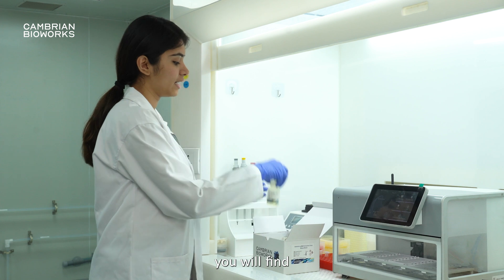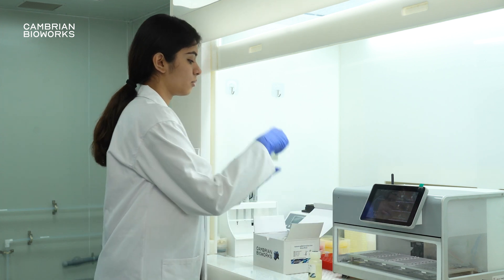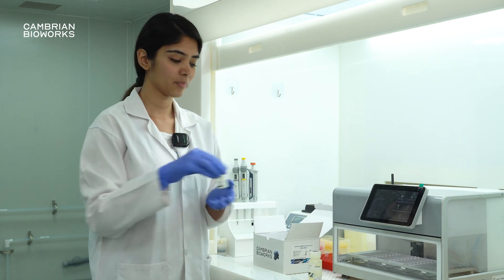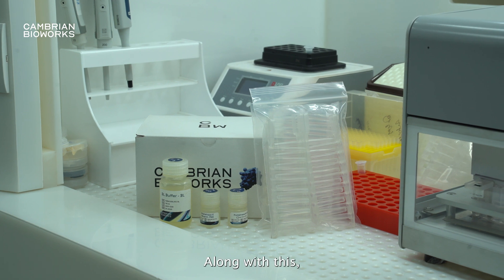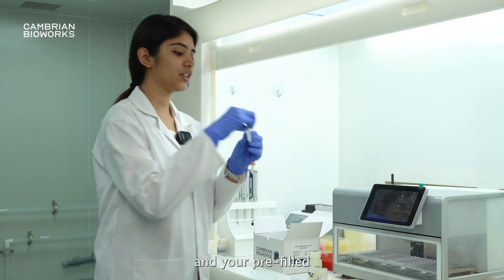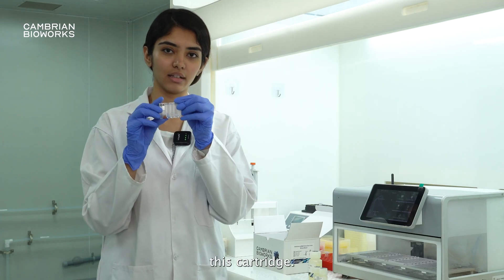Inside it, you will find the Blood Lysis Buffer, Proteinase K Diluent, and Proteinase K. Along with this, you will have the comb and your pre-filled sealed cartridges. All of the buffers are included inside of this cartridge.